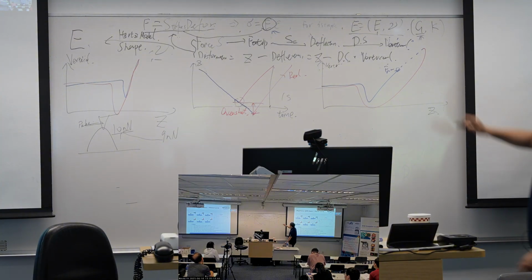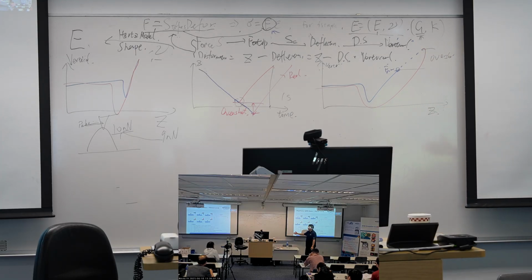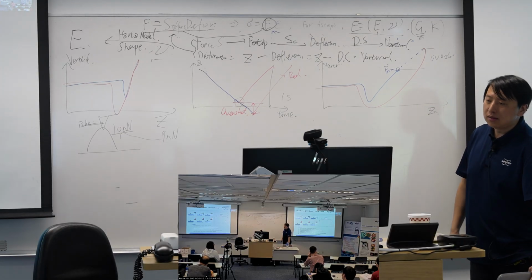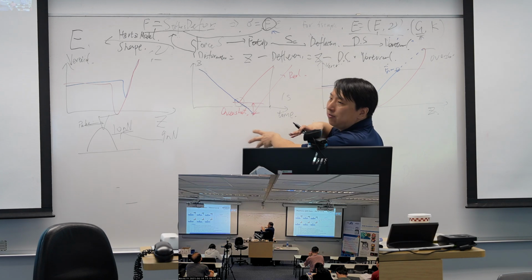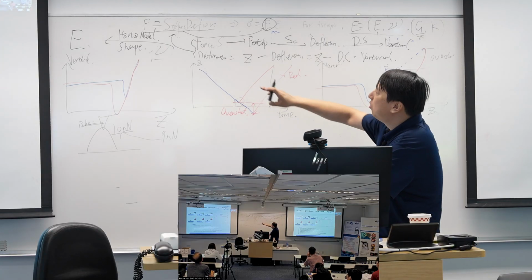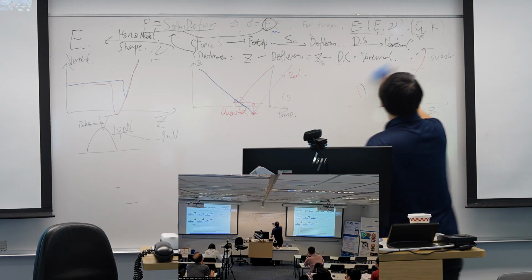So the overshoot can still harm your probe or your sample. Our key idea is how we can reduce the overshoot in the force curve. Since the overshoot takes place when we do it quite fast, ideally when you do a force curve, you want to do it slow. But if you do it slow, you cannot do mapping. So that's the idea here.